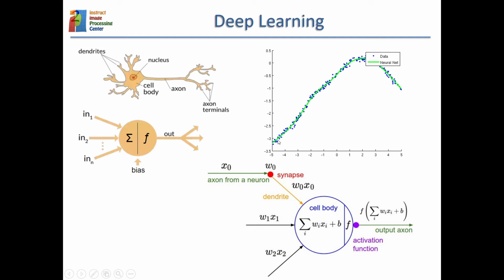Given some input information, these blue points would be the coordinates, x and y. The x and y would be the two inputs to the neural network, and then the neural network can be thought of as computing a kind of regression to the observed values.